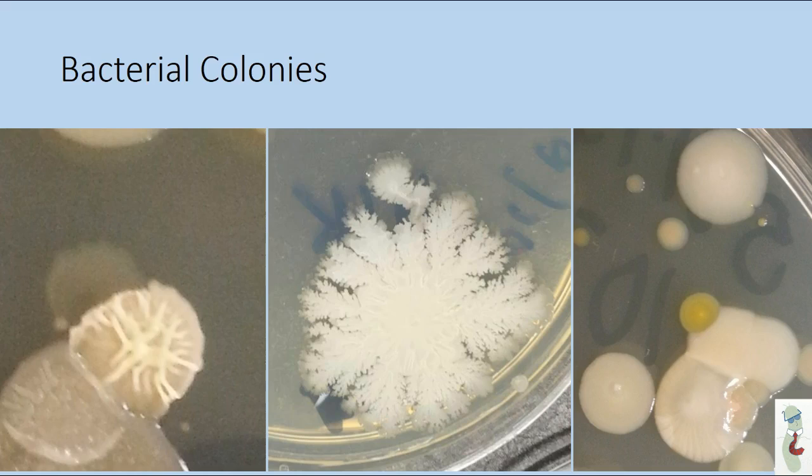Now, microbiologists describe each colony by their overall shape, moistness, color, size of diameter, whether they're flat-looking or raised in the center, whether their edges are jagged or smooth, etc. These differences contribute to the bacteria's overall colony morphology.